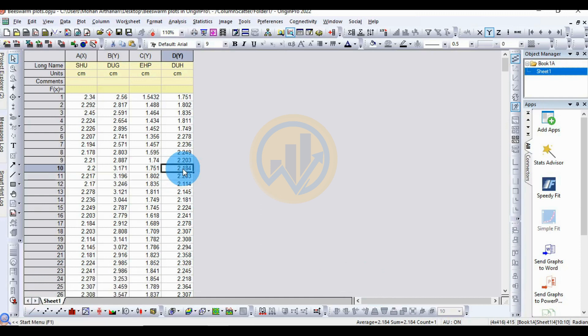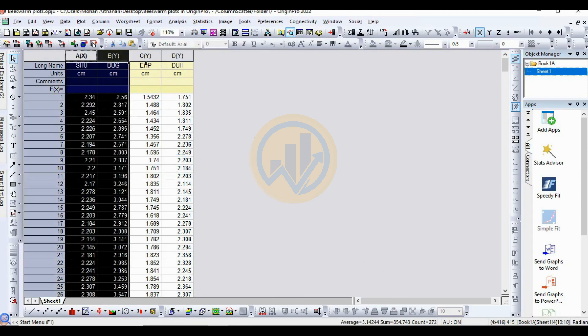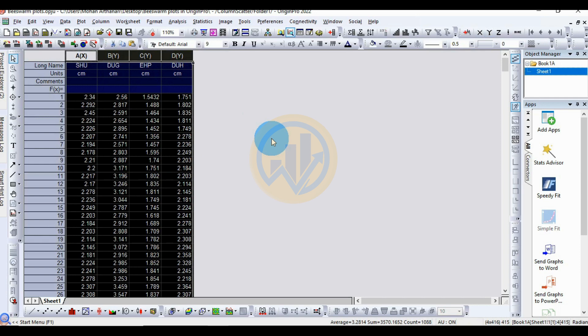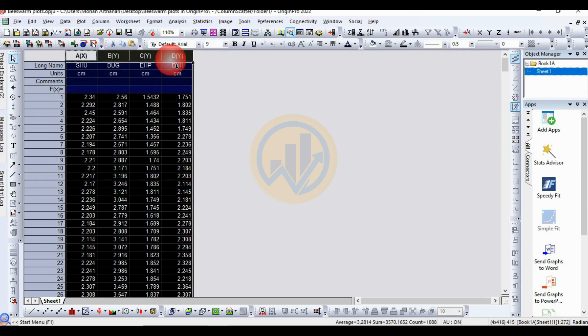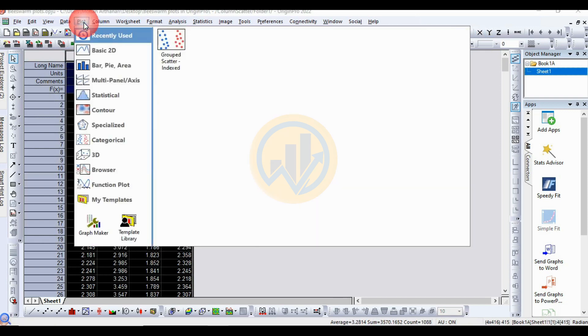Today we will discuss how to draw a beeswarm plot in the OriginPro software. The beeswarm plot is used for raw data samples only. This is for the raw data for four samples. Now let's draw the beeswarm plot in the OriginPro software.